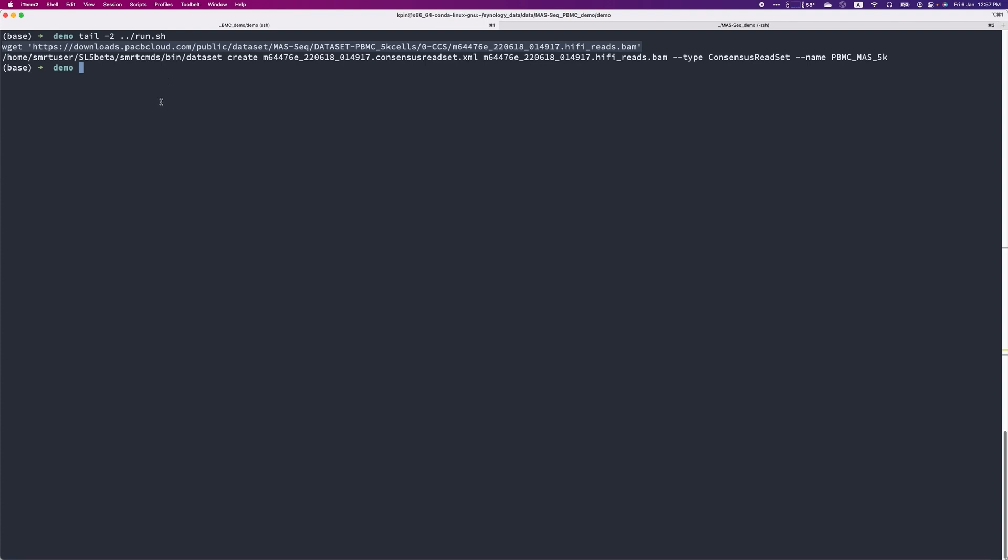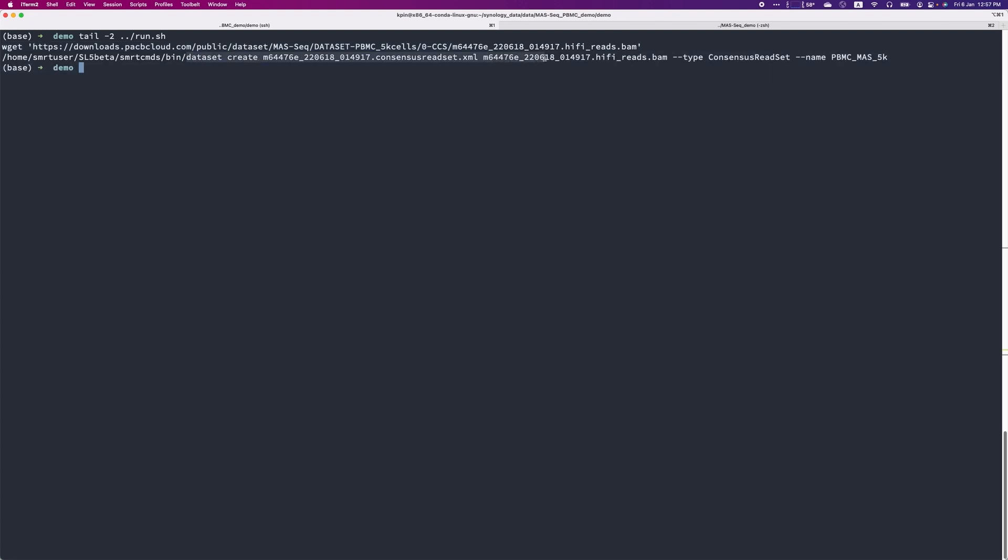After downloading the dataset, you can use the inbuilt SmartLink tools to create an XML file that can be used to import the dataset into SmartLink 11. This is an example of command to do it, so that you will have to change the path in front into the SmartLink path on your server.